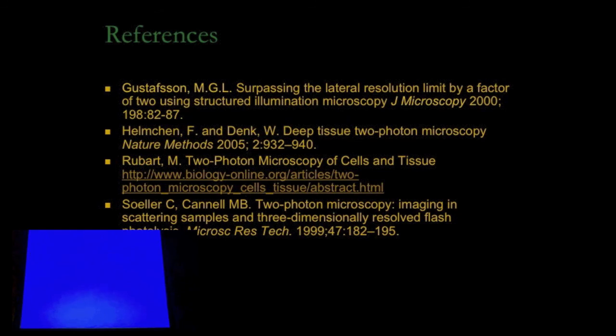There's a deconvolution software called Huygens, and it can calculate and give you model point spread functions for various NAs of objectives, wavelengths of light, and whether it's single photon or 2 photons. So you can go to the Huygens website and play around with that calculator and see the size of the PSF. Great. Thank you, Andrew.